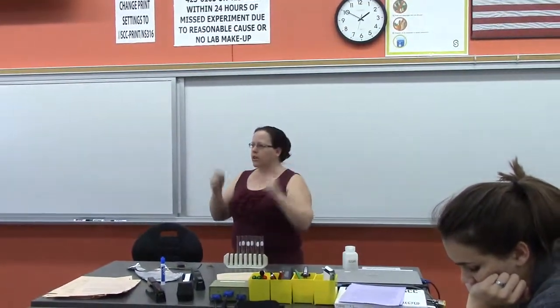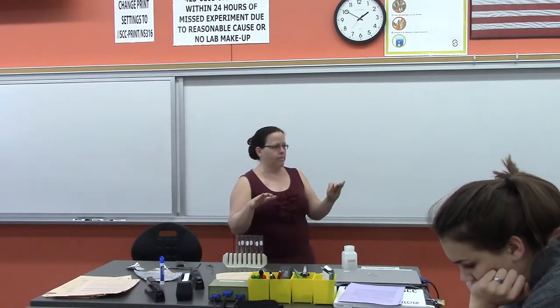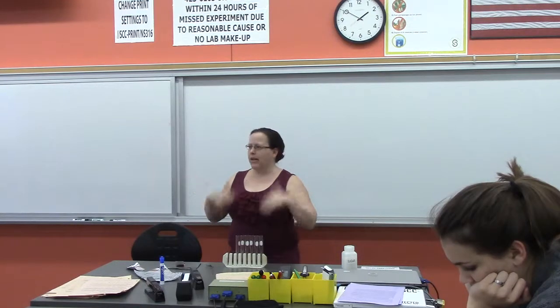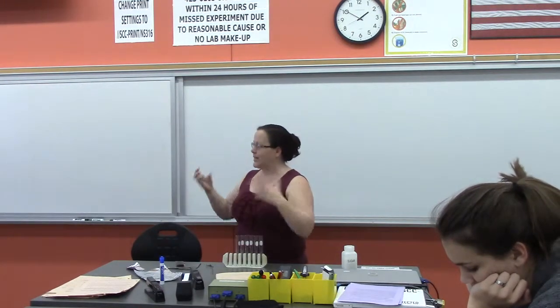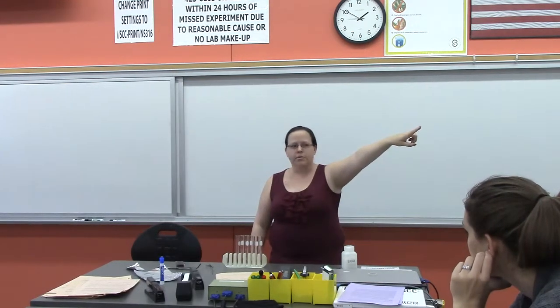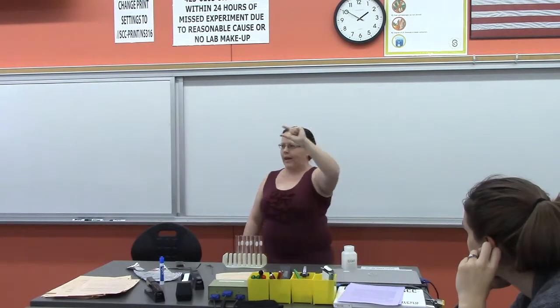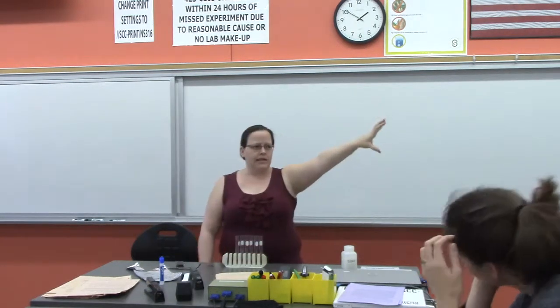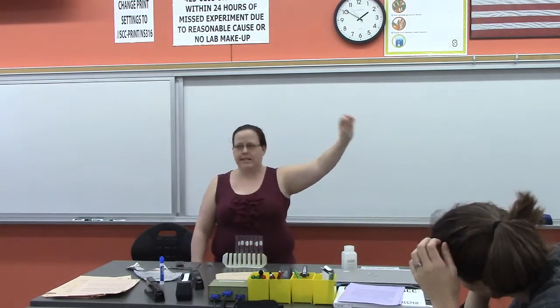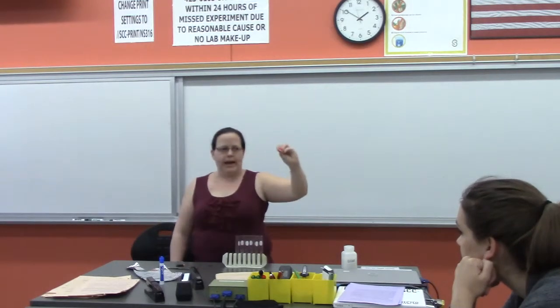Anytime we're in lab and water is part of our reaction, we never want to use tap water. Okay? And that's because tap water has other minerals and things dissolved in it. It's not just water. So in our classroom, the sink on this side of the room, there's a separate faucet that has a little white handle and a little white tip. That sink faucet dispenses distilled water. That's the one we want to use anytime water is part of our reaction.